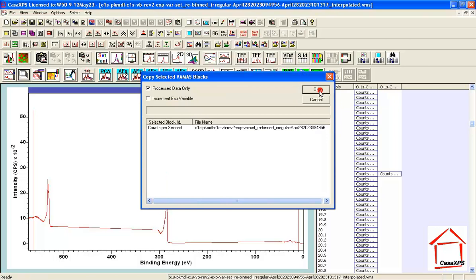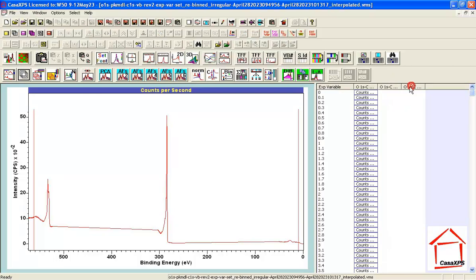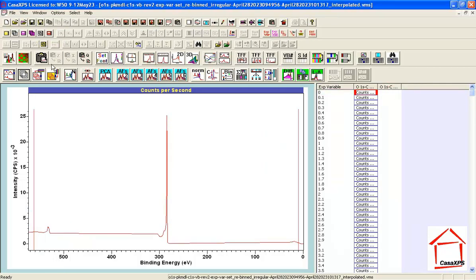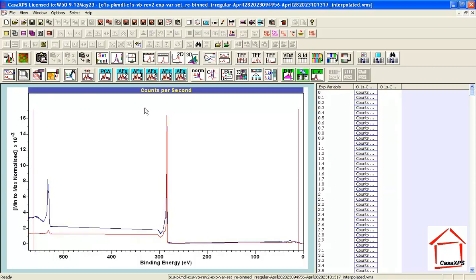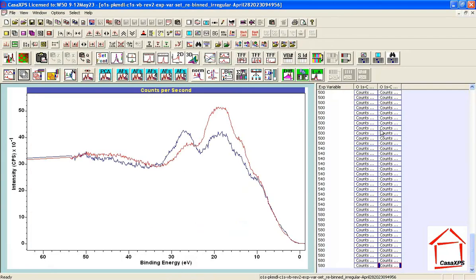Continuing to look for shapes plausible in the sense of looking like carbon with evidence of oxygen bonded to carbon, and checking the valence band — this one is plausible: we certainly have signal contributing to the valence band, signal in the carbon, and a peak that looks very much like an Oxygen 2S. I've come up with a second example of a spectrum that looks plausible for all three photoemission processes. I'll copy that one as well.